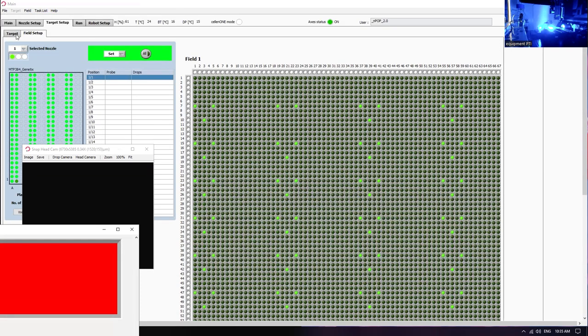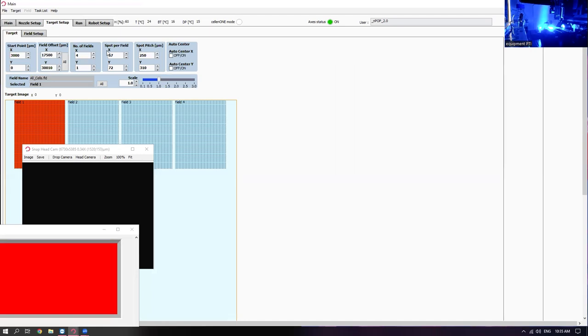There's the minimum. It depends on how big they are, how hydrophilic the surface is. If you want to be robust and be able to do experiments without having to super fine tune droplet dispensing, give yourself a couple hundred microns between drops. If there's any surface heterogeneity, which typically with these slides there isn't, the drops will move to the most hydrophilic location. So if you want to build in tolerances that allow high throughput and ease of use, you want to give yourself a little extra space.